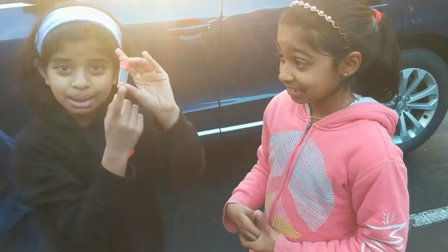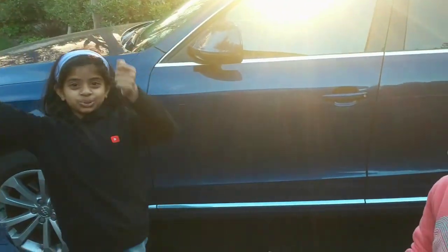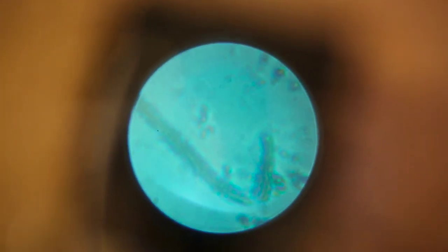And now we're going to examine it because we're back home sweet home. We looked at the dirty water — it was so bad. It's really gross. Let's show you. Right there. Eww, that is so gross, like wiggly worms.